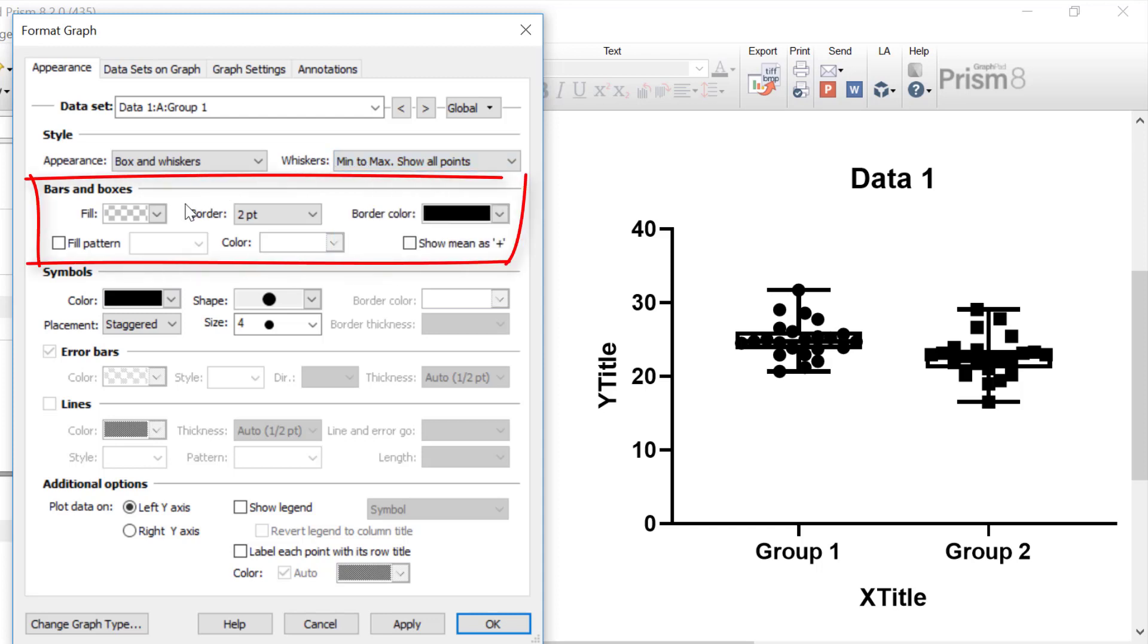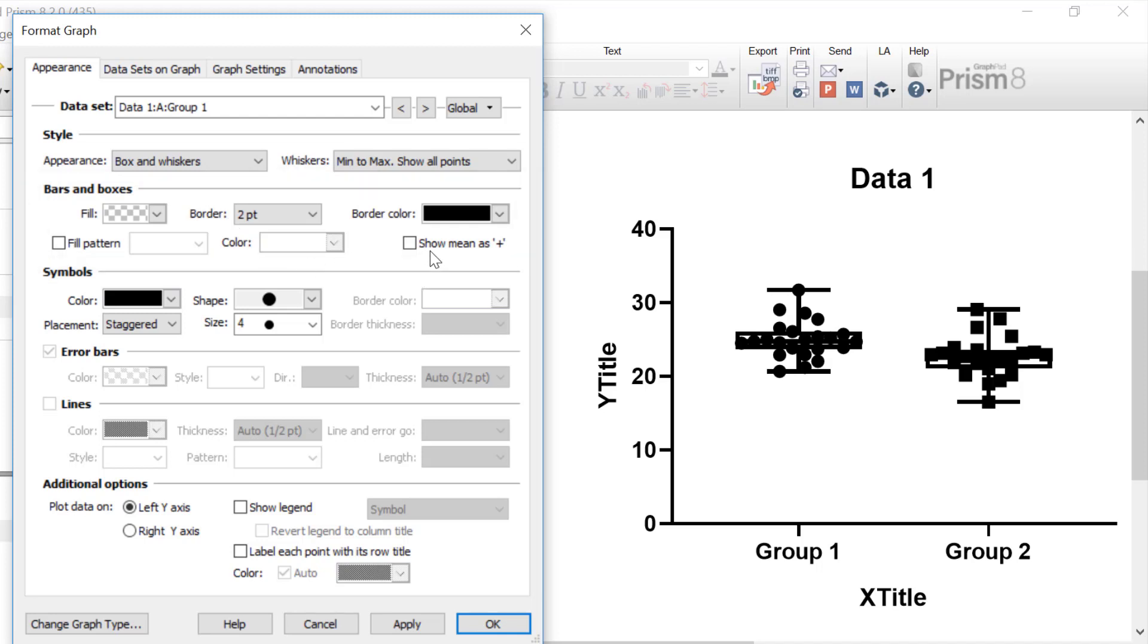Under the bars and boxes header, you can change the fill color, the fill pattern, as well as the border thickness and the border color. Additionally, you can also tick the option to show the mean as a plus symbol. So by ticking this option, a plus symbol will be entered where the mean value is on the box and whisker plot. This may be useful when you're comparing and visualizing data that has been statistically compared with a test that compares the means of the groups. So always bear in mind, when you're visualizing your data, how that corresponds to your approach to statistical analyses. So while we're here, I'm also going to change the border color of my first group to a dark blue.